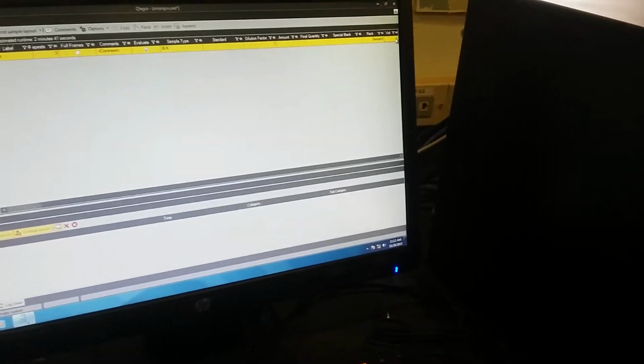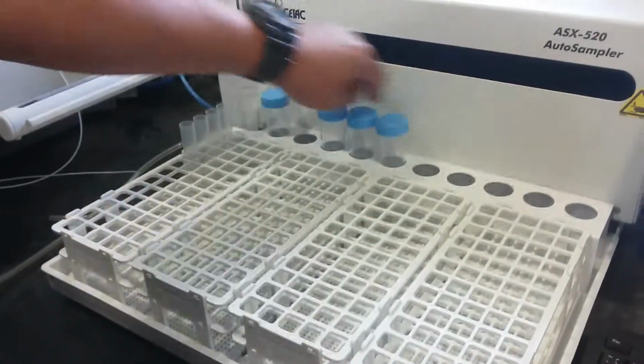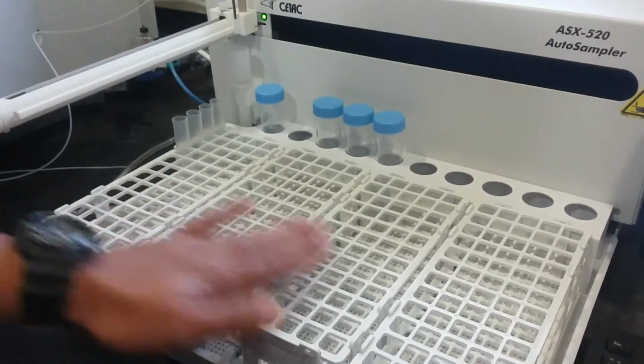Clear? Yeah. So this one is standard. This is rack 1, 2, 3, 4. Okay? Say again. Standard. So this is standard. This is rack 1, 2, 3, 4.